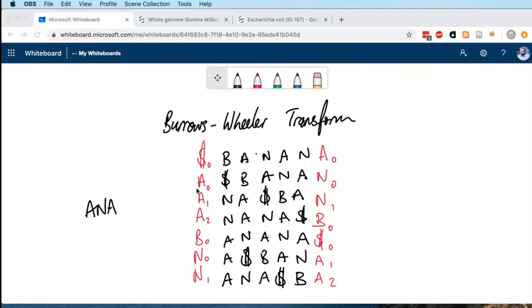So we're going to use one of those pieces of software, and the software that we're going to use is called Bowtie2, which many of you may already have heard of. And Bowtie2 uses the Burrows-Wheeler transformation and applies it to the reference genome of interest. So it transforms that reference genome according to this regime that I illustrated last time out, which makes it nice and searchable.